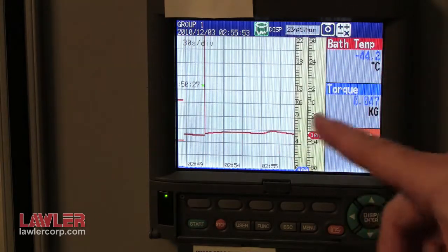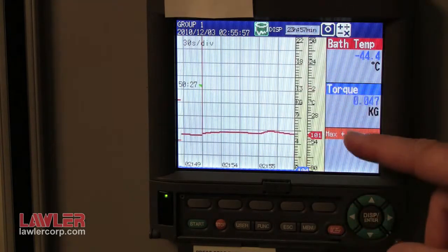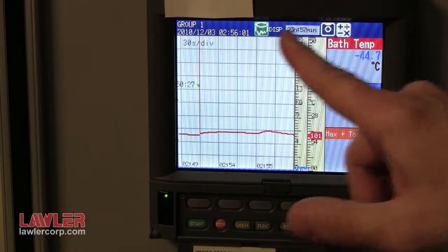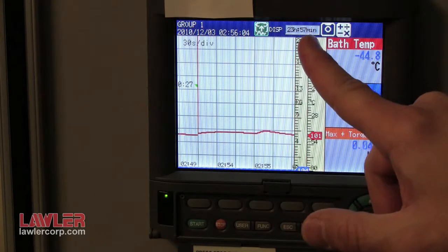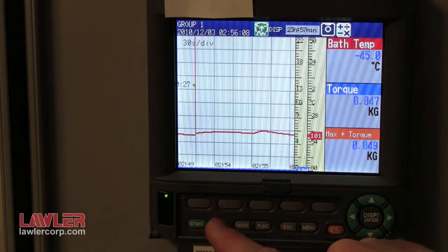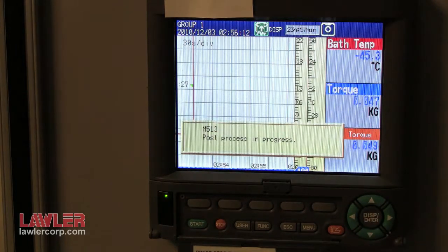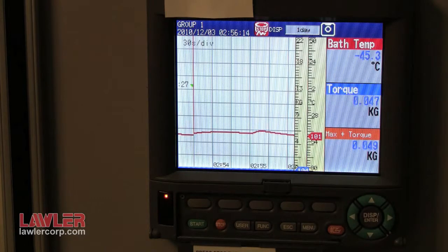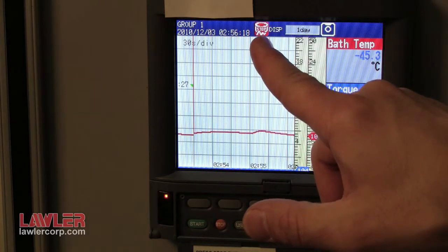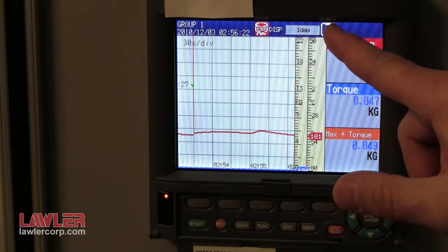For demonstration purposes, the system is not set up right now, but you can see the different values. The green icon indicates that the unit is recording. There is a horizontal bar graph that indicates the available memory. To stop recording, simply press stop, hit enter, and the data is saved to a compact flash memory card. The indicator icon changes to red. As the memory card fills up, the floppy disk icon will fill up.